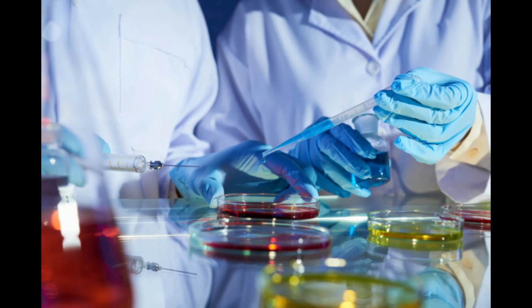Okay, one final bit of information here. On Thursday, you're actually not really doing anything other than doing the lab. You're not going to have any notes to take, you just took all the notes that you'll need to do the lab. And then I'll have to incubate these over the weekend, and then the following Tuesday, you'll actually get to look and see how well you did. So you won't have anything to write down until next Tuesday.